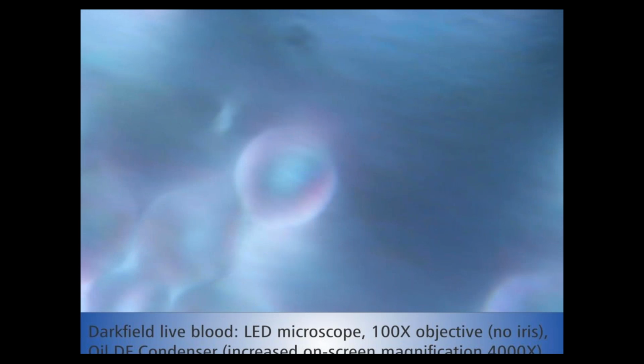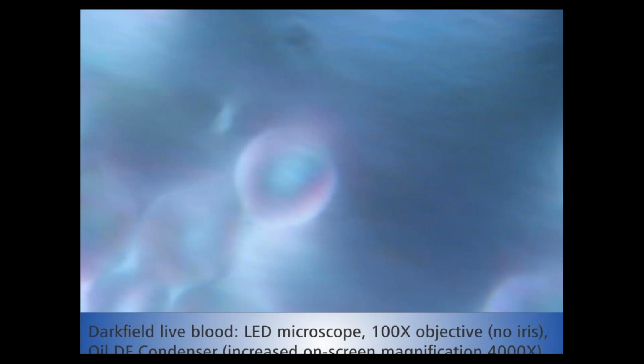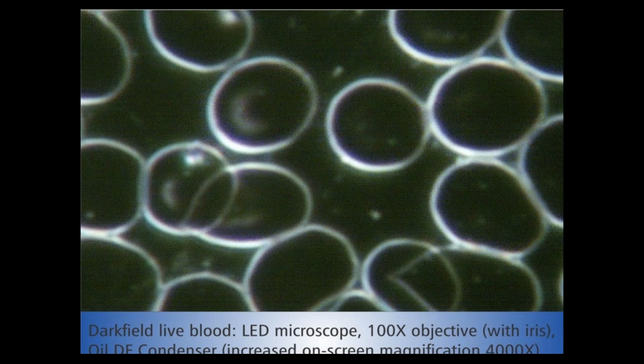Compare that to this next image, which is actually of the same blood sample but using a 100 times objective with a built-in iris diaphragm. And you can really clearly see the difference between these images. The objective without the iris diaphragm allows through too much light, and that is really why we can't see that much at all. There's just too much reflected light in the sample, which makes it basically impossible to see anything.